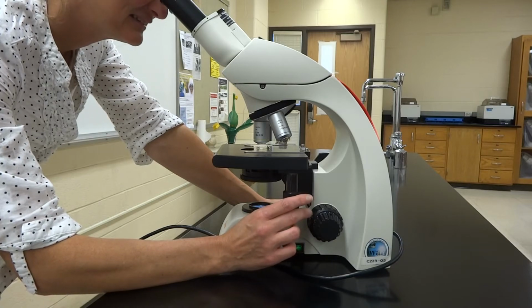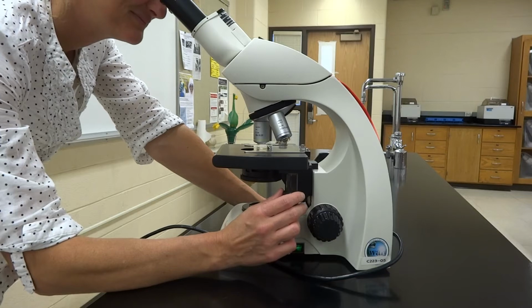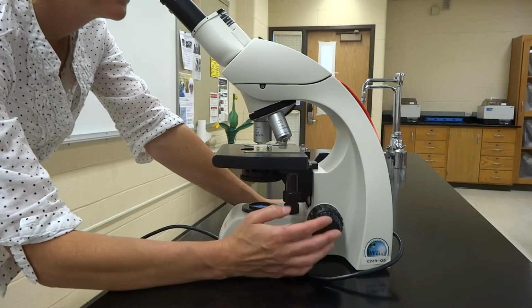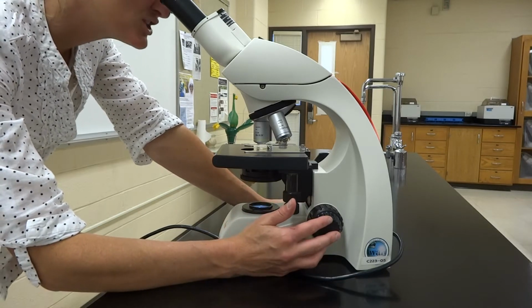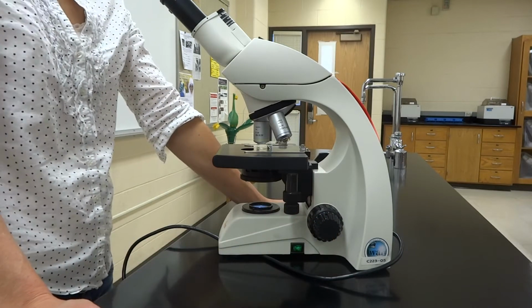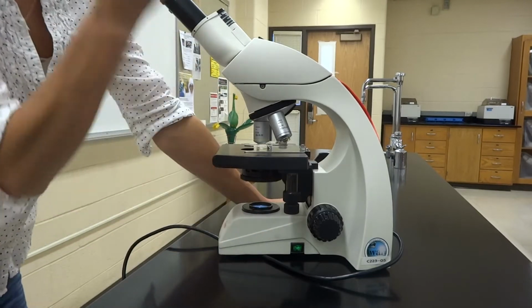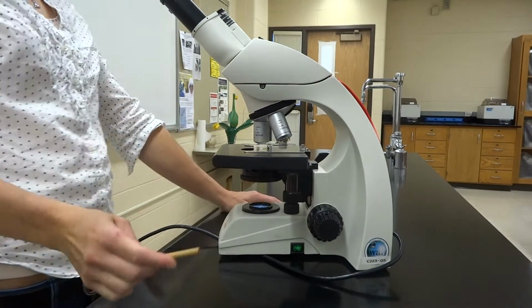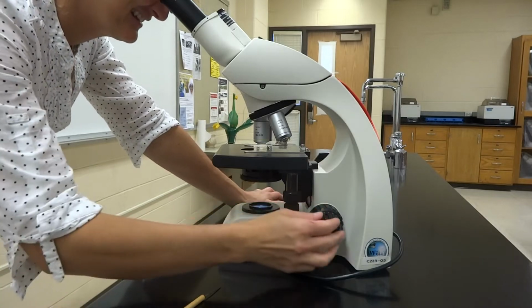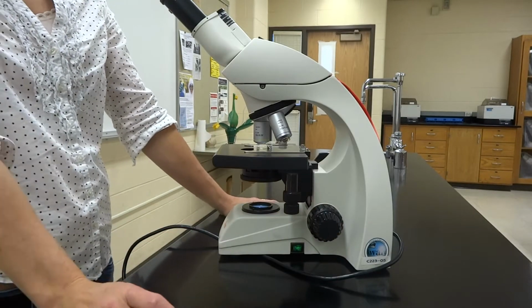So once you get it to 10x, you should be able to see the specimen that you're looking at very well. And then you'll use your fine focus again. At this point, you should never, I will stomp my feet, ever have to touch the coarse objective again because these microscopes are parfocal and par-centered. It's very easy to do.